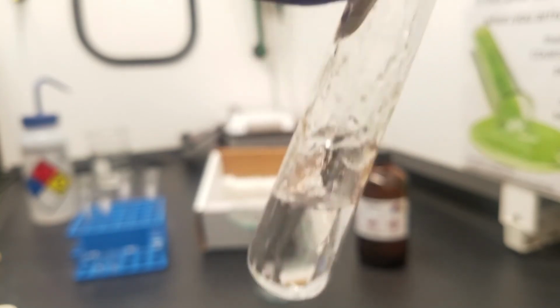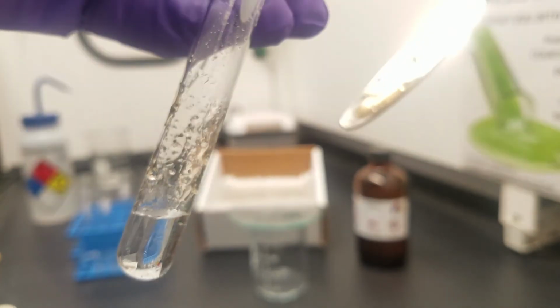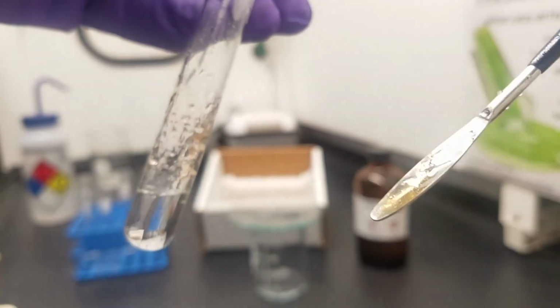And so after attempting to mix here, I'm going to pull the spatula out and show you the spatula so that you can try and see on the spatula if there's anything present that didn't actually dissolve and mix well. I am wiping it off in between to make sure we don't get any cross-contamination. I don't know why I didn't show that, because that would have been a useful technique to show, which is really just wiping it off on a Kim wipe.